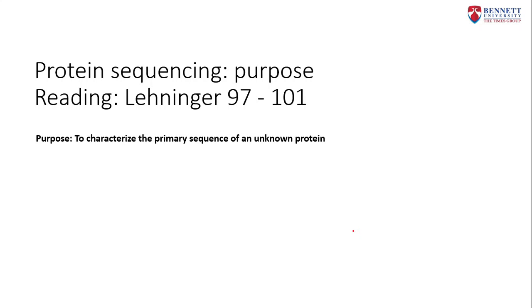So next we are going to learn, or at least start to learn, something called protein sequencing. What is the purpose of protein sequencing? This is to characterize the primary sequence of the unknown protein. Proteins can be written as either 3-letter codes or single letter codes. So this is your long protein.